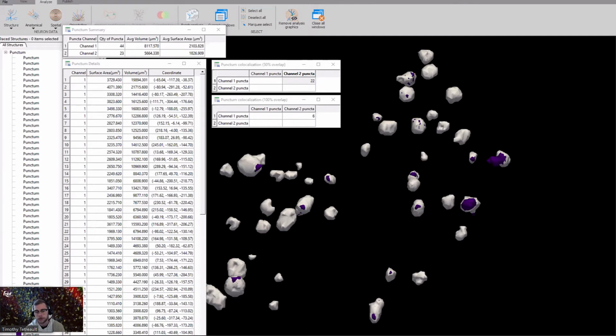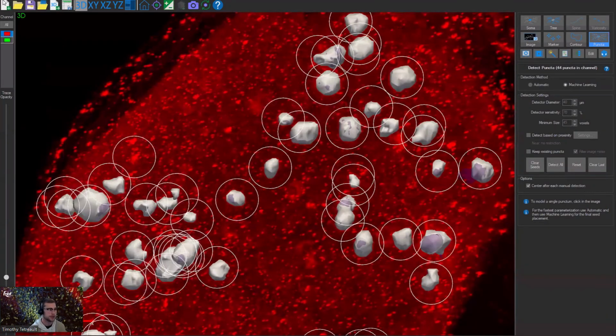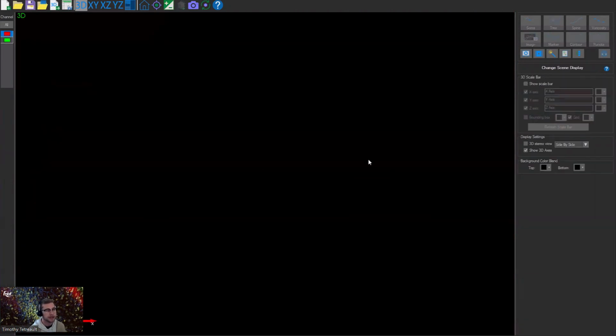We have just a couple more minutes here, so I'm going to pull back a little bit more so that I can show some of the results that we've worked on over the past year, some of these analyses. So I'm going to, once again, close Neurolucida Explorer. I'm going to close the image and data files that are open here, and I'm going to bring in an entirely different set of data.